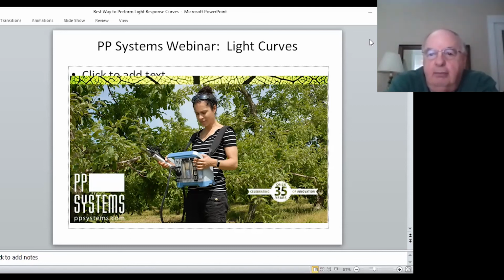Okay. How are you normalizing photosynthetic response rates to plant tissue, leaf area, fresh weight, and thickness? That's up to you. These are all area-based, and anything beyond that is on the user. Leaf area is the standard, and it's the only logical way to do it, but you can sometimes explain species differences or growth condition differences in rates per area based on things like mass or protein or chlorophyll. But that's on the user to do.